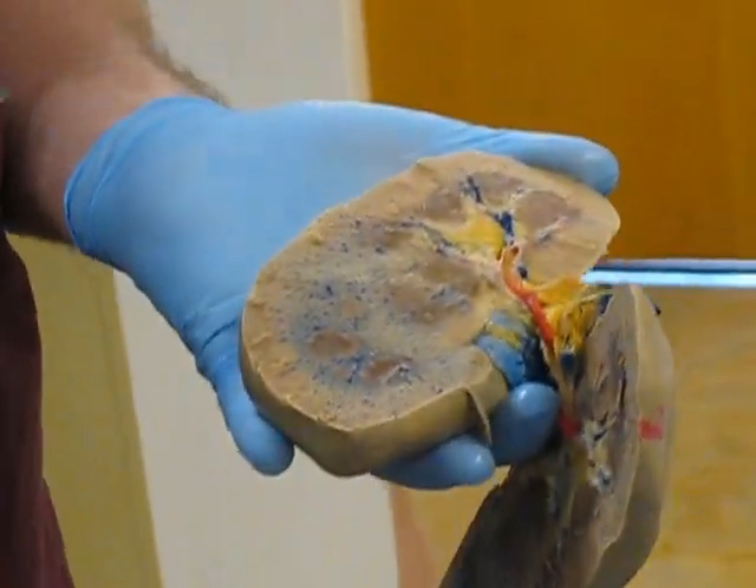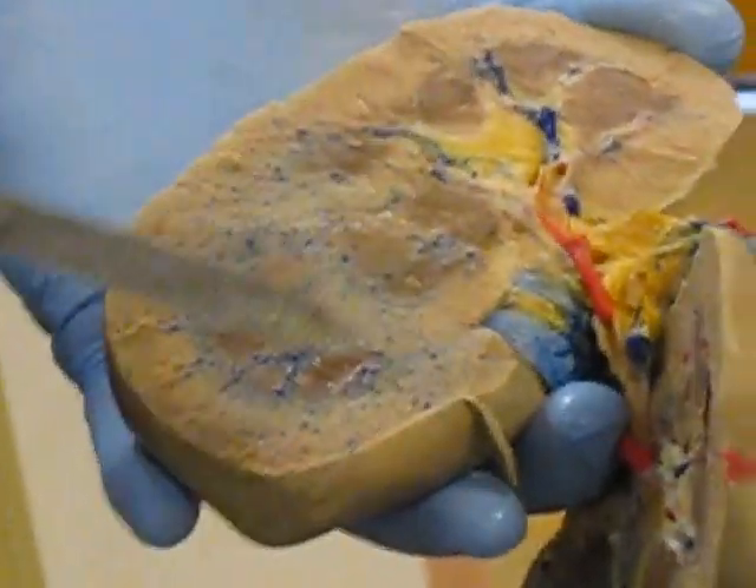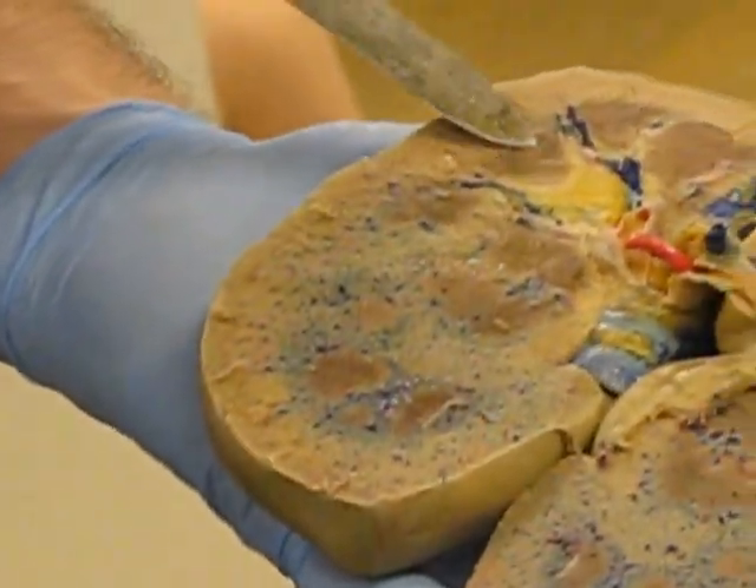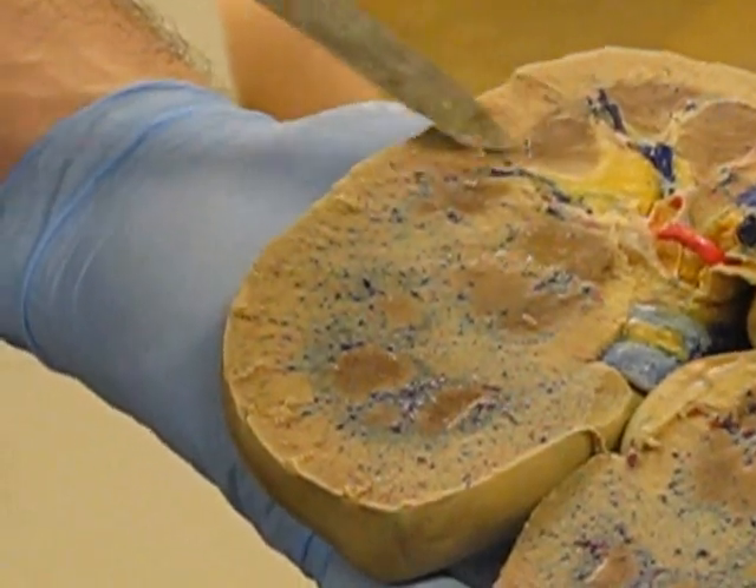Immediately you can recognize the renal pyramids — they're very clear. Depending on where you cut through yours, mine's a little off-center, so you can't really see the pyramids over here because I cut them wrong. But that one right there, I cut it right down the middle and you can clearly see the pyramids.